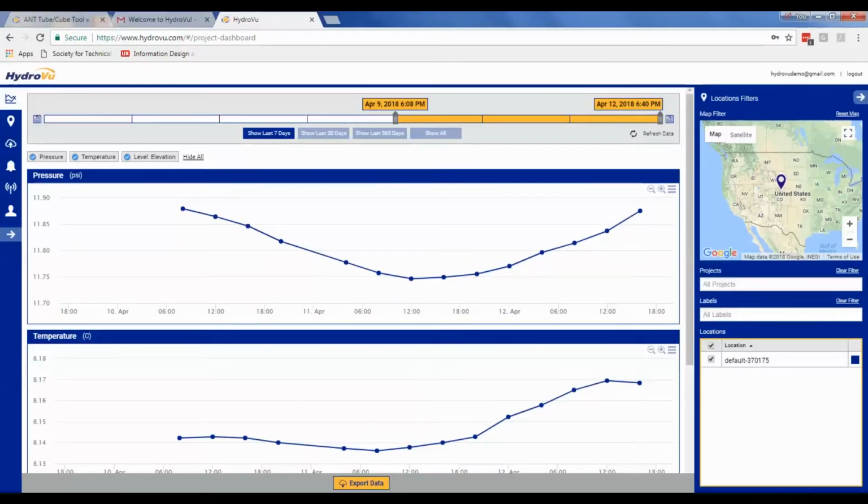By default, all locations show up in Colorado at our office for the first time. The naming convention is default-serial number of your instrument. Have no fear, all of these settings can be customized. You can move the pin to show up at the physical location of your actual device, and you can rename your instrument so that it shows up as you want it to.